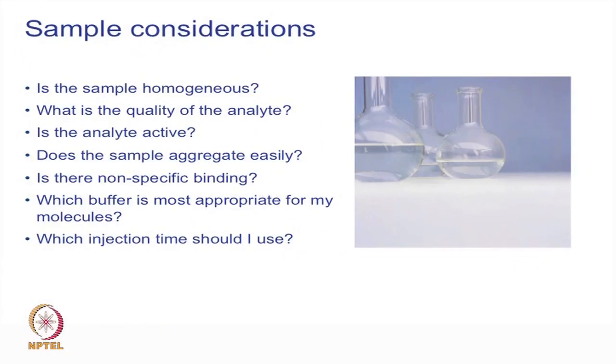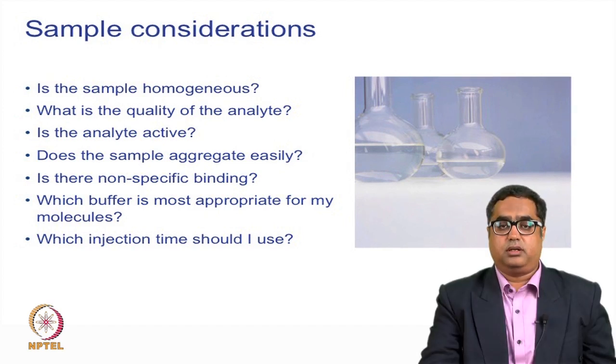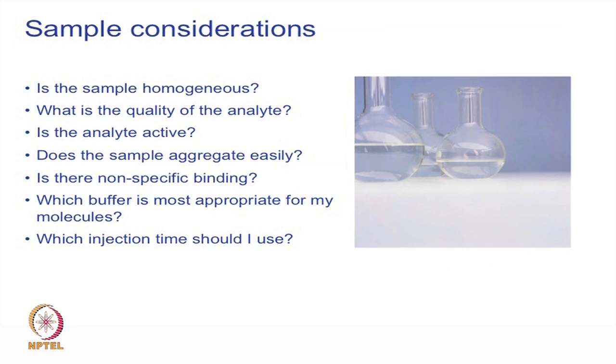The sample or analyte is a major contributor to bad data. It is very important that we purify and characterize them before experimentation. Homogenous samples are good enough to be considered - make sure your samples are highly homogenous, good quality, active, do not aggregate, and do not give non-specific binding. It is also very important to understand the right buffer for a right sample and, once good sample conditions are identified, to think about the association time and when to set up Biacore experiments.